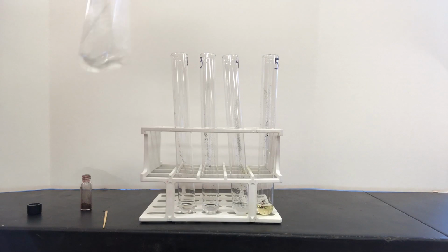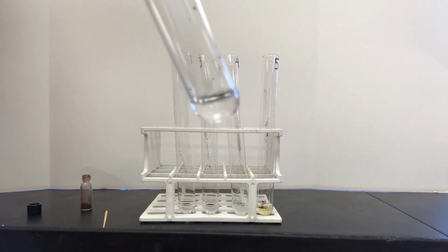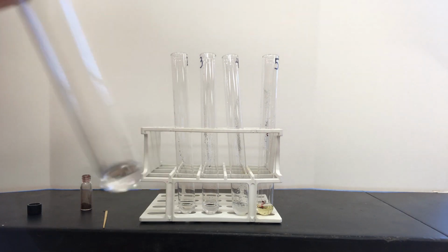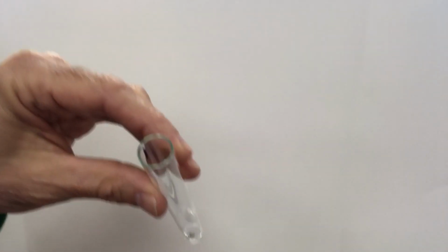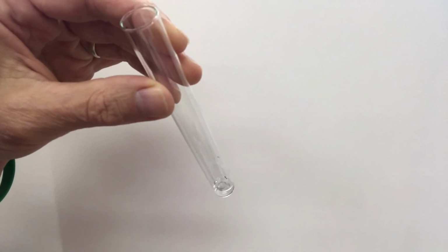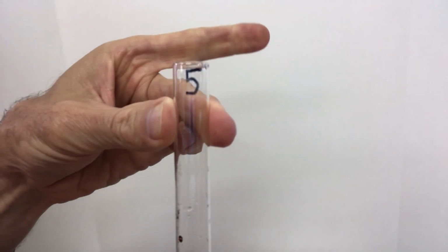Using the negative control, notice that the powder simply floats on the surface of the water. Since water is hydrophilic, we don't expect the dye to dissolve in it. This is the same for tubes 2 through 4. Test tube number 5 with the oil, however, is hydrophobic and dissolves the dye, turning a bright red.